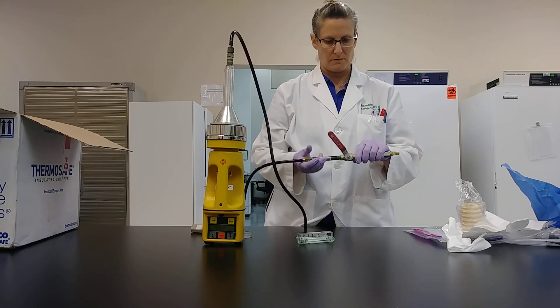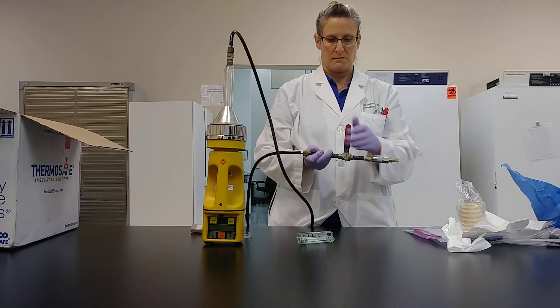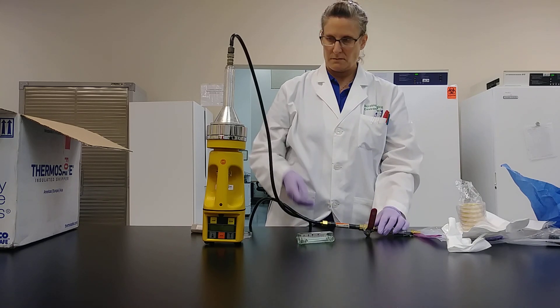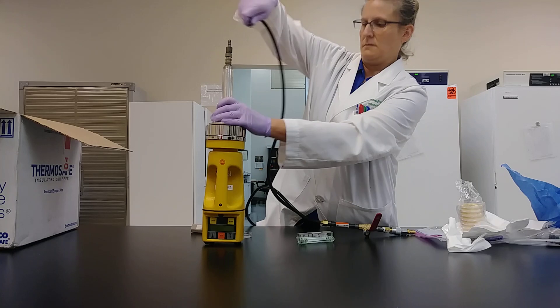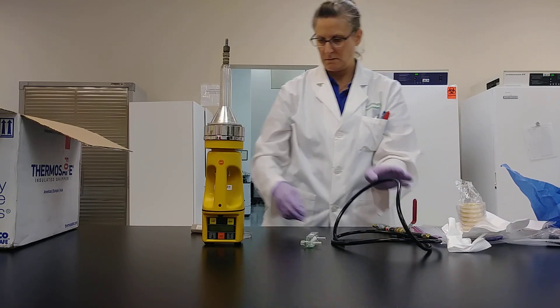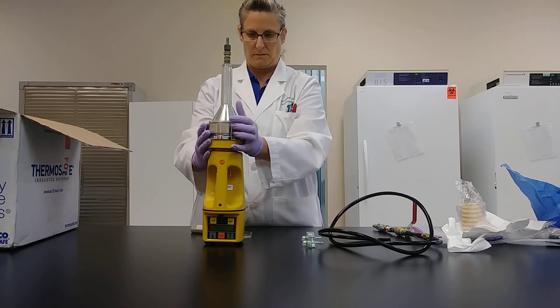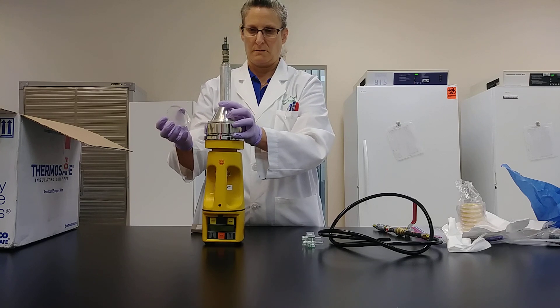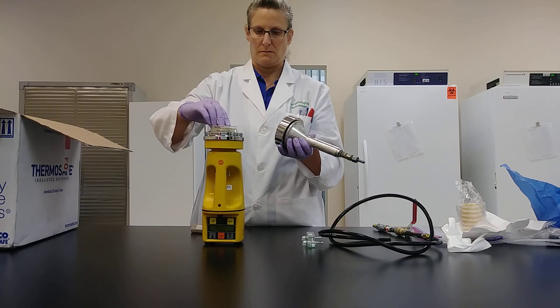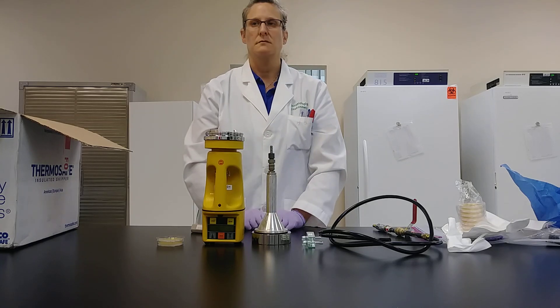Once your time is up, you can turn the air off by rotating the red handle to the off position, and disassemble your setup by taking the connector tube off and removing the SAS nose. Now place the lid back on your sample, and your sample is ready to prepare for shipping.